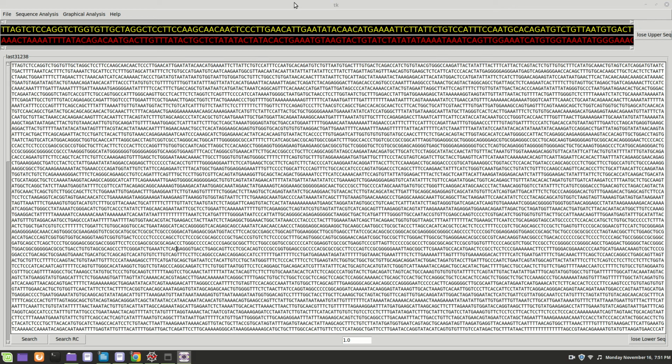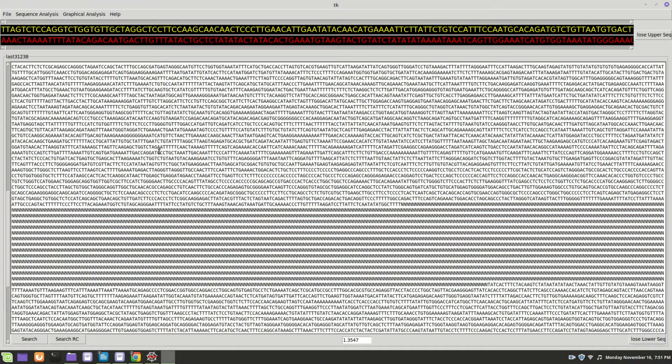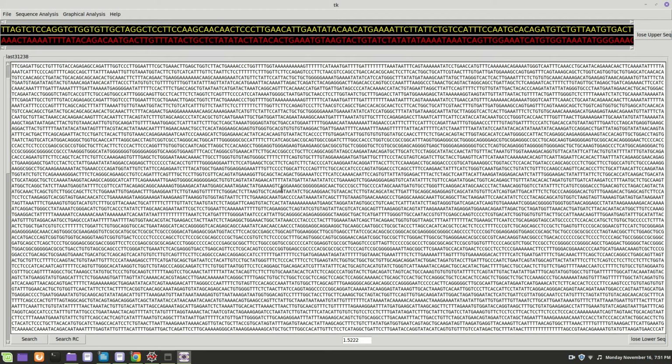Okay, what I have here is the last one-third of the larger contig that we're using in here. So this has that last gene on it. It actually has the gene before it also, that little short one. So this is just the sequence. Here are the two places where the ends are. And I'm not going to do the CGs.